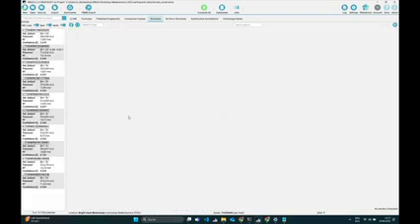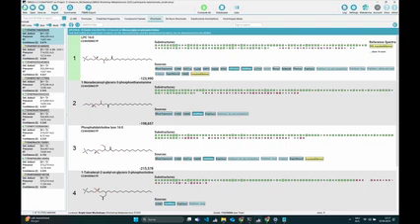However, in general, we have a tool called ElGordo, which, before CSI FingerID runs, tries to detect whether an MS/MS spectrum might belong to a lipid. If this is true, it runs a rule-based lipid detection like you know it from other lipid tools. This is still in early stages, so I think we do not yet support all the lipid classes you might expect, but at least the most common ones we have. It will not change anything in the CSI FingerID routine. CSI FingerID will still run.